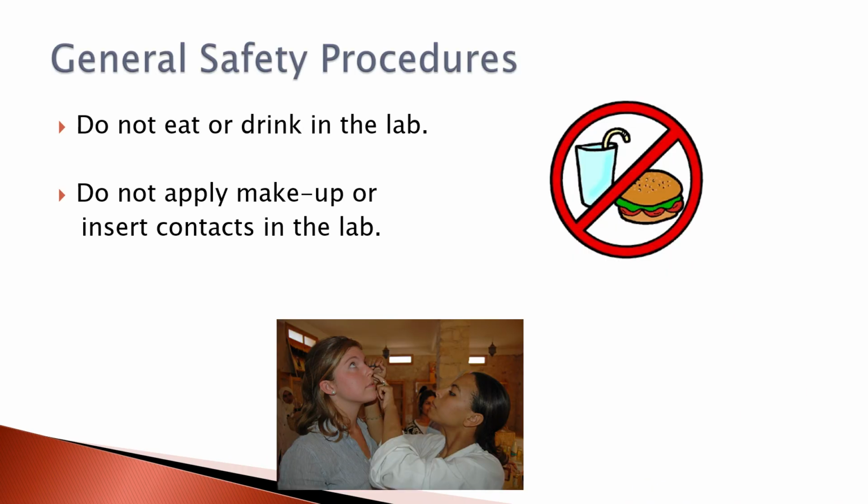So some general safety procedures. Never, ever, ever eat or drink in a lab. Doesn't matter if you have the cap on it, still shouldn't come in the lab. There are things in there that you could accidentally, inadvertently contaminate with and end up really sick. Never apply makeup or put your contact lenses in lab. I wear contact lenses as well, and if something funny floats through and I need to take my contact lens out, I have to leave to do that.